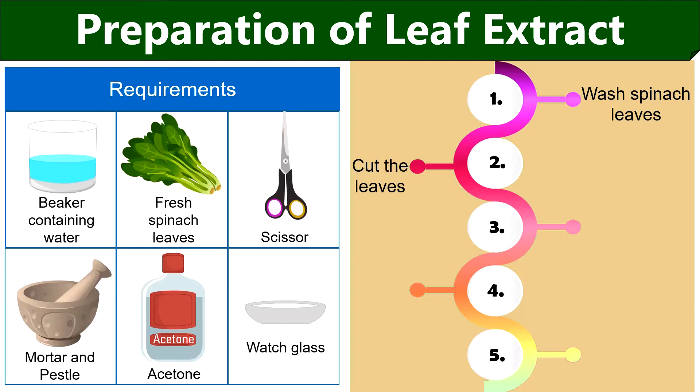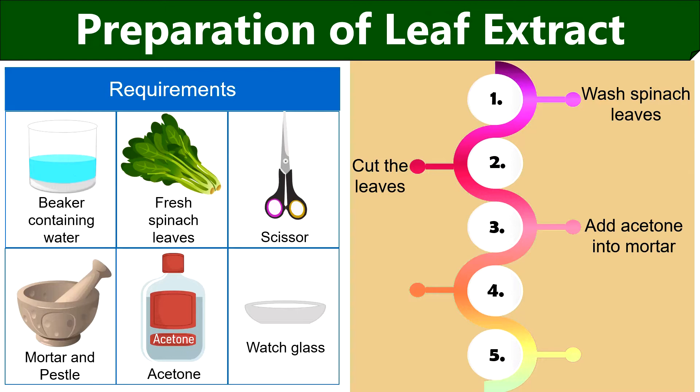Then cut the spinach leaves using scissor into the mortar. After that, add a little volume of acetone into the mortar. Here acetone is used because it gives high resolution of molecules between the absorbent paper. Then crush the leaves using pestle until a liquid paste forms.